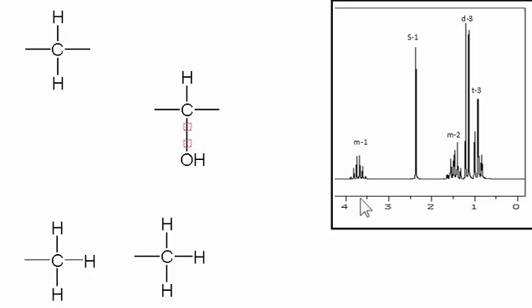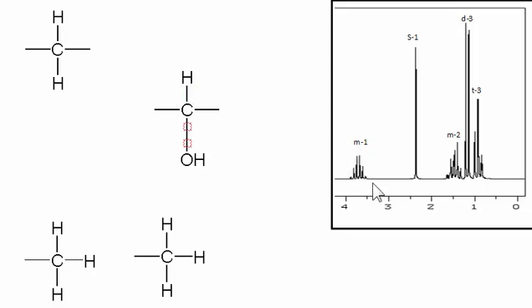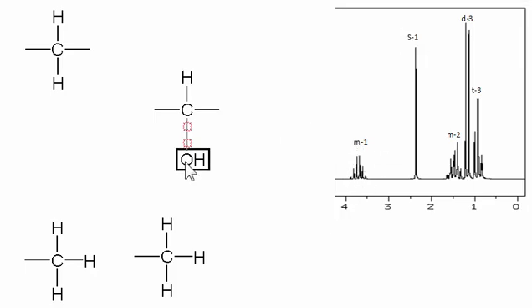So if you think about a methylene group, or methine group, typically starting around 1.5, this hydrogen starting around 1.5, then this oxygen shifted around 3.5. So that explains this one. It doesn't explain the multiplicity, all the peaks that you see, but it explains where this is. This singlet is most clearly the alcohol, and then we have to add these other groups.